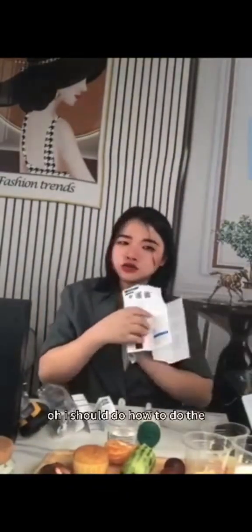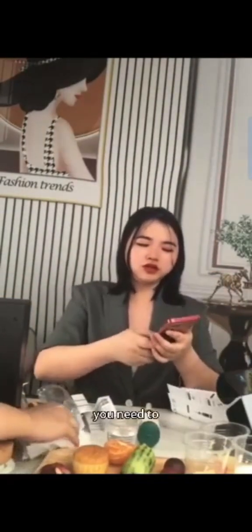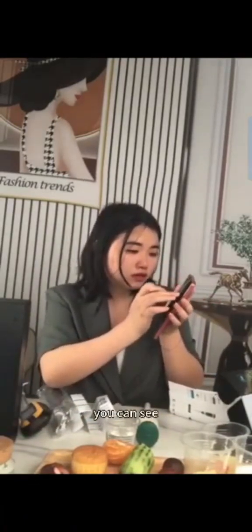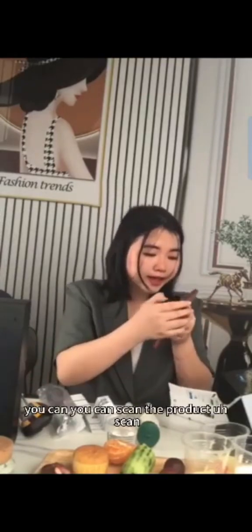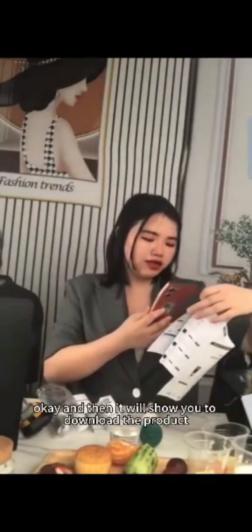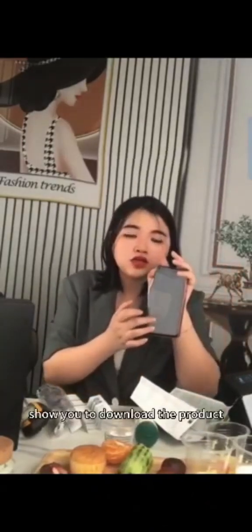Oh, I should show you how to do the Bluetooth connection. Okay, firstly, you need to open your browser. You can scan the QR code here. Okay? And then it will show you to download the product.